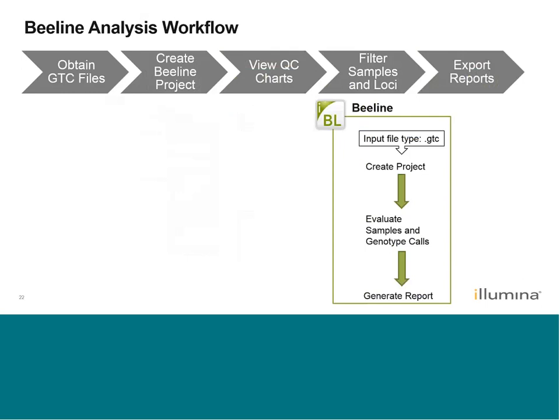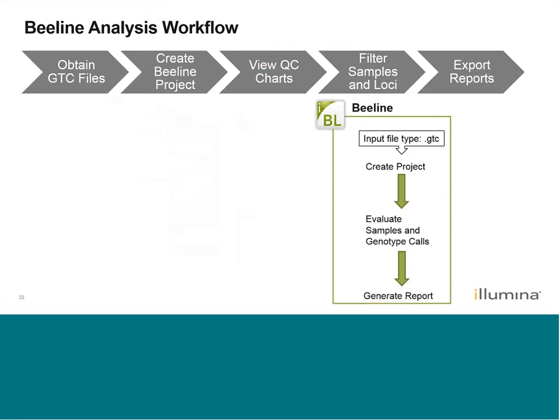Now that we have the software installed, we can start using it. The workflow is laid out in five steps: if we don't have GTC files already, we need to obtain those GTC files. Then we can create our project. Within the project, we can view the charts and filter based on QC metrics and criteria. Once we've filtered down our project, we're ready to export our report.